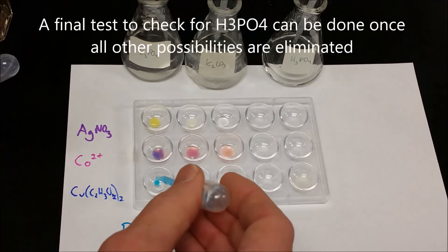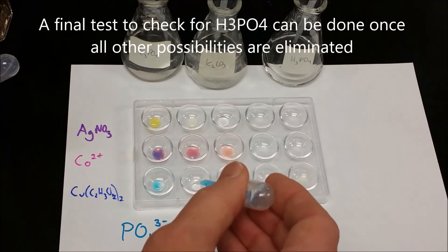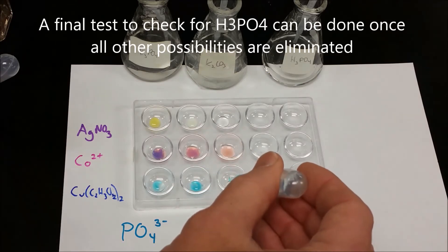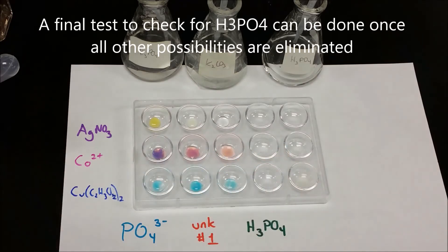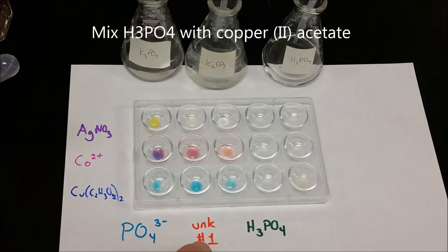At this point, you should only be checking between phosphoric acid and water because it's going to give you the same result whether you do a phosphate, an unknown, or phosphoric acid. But phosphoric acid will form a precipitate while water won't.